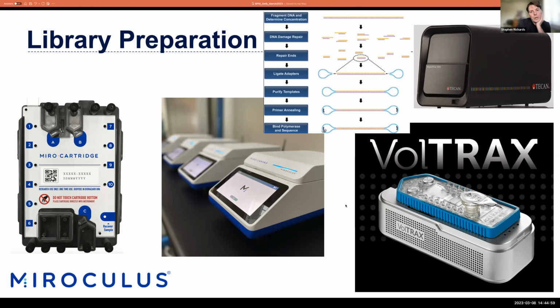I've got a quick question, Scott. Sure. What would you recommend for a very advanced high school class? Very advanced high school class, do it by hand. Okay. I don't know, why not? You need a centrifuge. The other thing, if you don't have a shearing device, I said you can use a needle. The other thing you can use is a Covaris g-TUBE, which is a little spinny guy. You just need a centrifuge to run it, and it does a pretty good job. I guess you need to do it by hand, and none of this stuff is too cheap. But if you got the right funder, go for it, right?